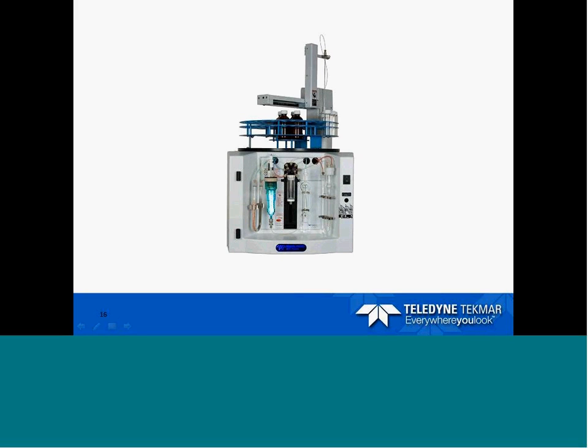To the right, I apologize, my mouse keeps going away. Right here, this little glass bulb apparatus is the moisture control system, and over here is our IC sparger, and this is going to hold the sample while we're purging the inorganic carbon out of the sample, getting it ready for analysis. With the addition of the acid, the purge gas is going to flow through the sparger and remove all that inorganic carbon.